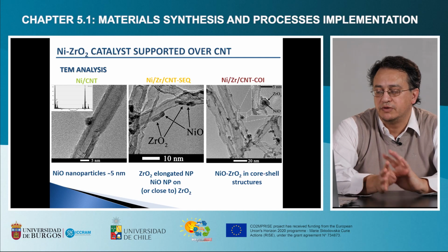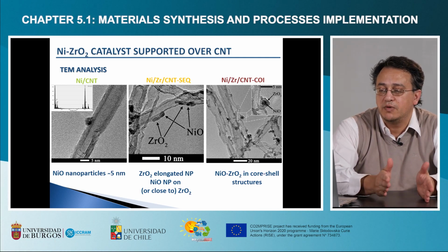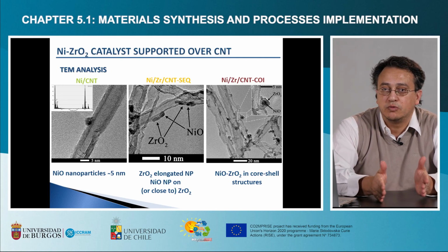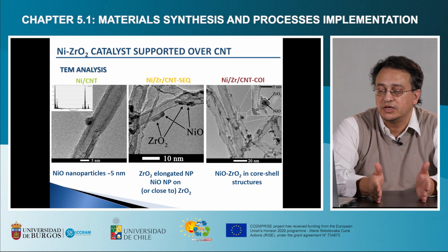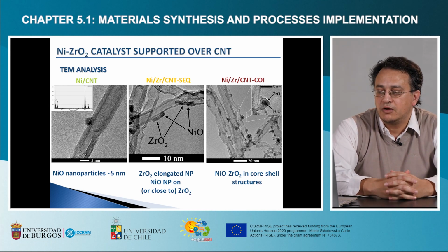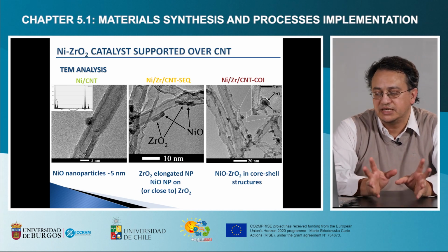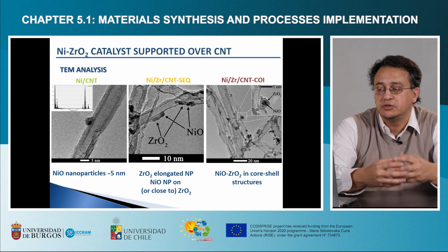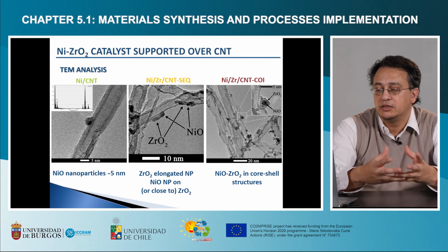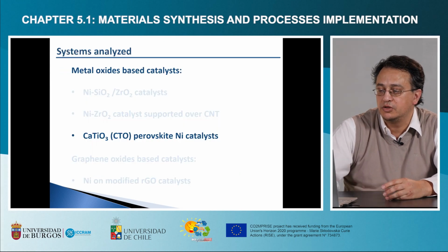So as you see, we have three different systems where we can identify where the CO2 molecule interacts, in which place, or with what kind of solid it interacts, and then we will find how we can measure the activation of that. That was made by a basic wet impregnation system using an aqueous solution in which you immerse the nanotubes, and then you can synthesize the system to get the oxides on top of the carbon nanotubes.